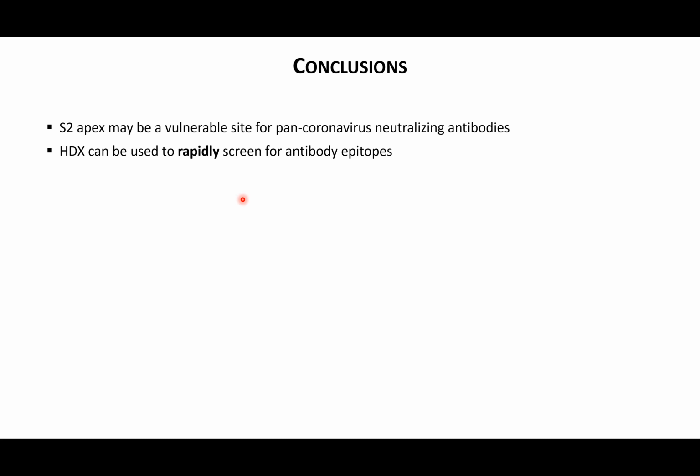Hi, Sheena. Robert Good from Monash, in Tony's group, actually. I was just wondering more about the post-processing with enzymes and things. How limited are you there with having to maintain your low pH and cold, and how do you overcome that?